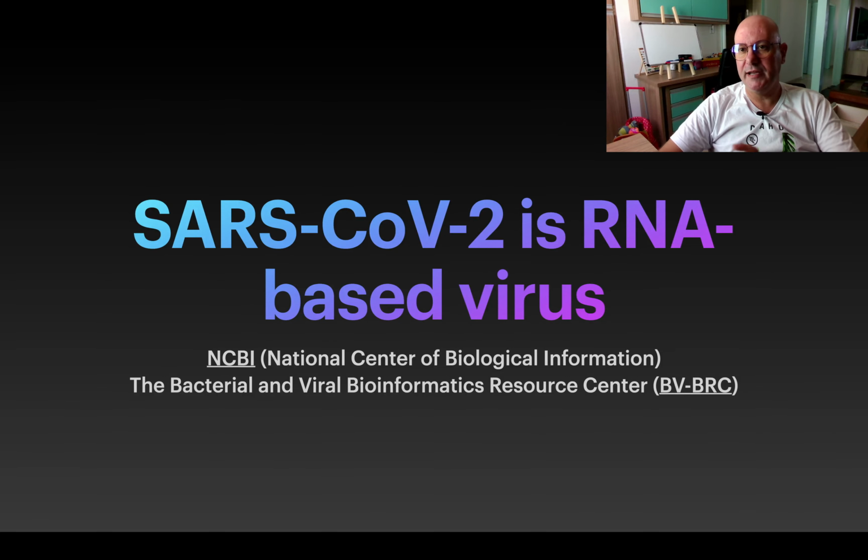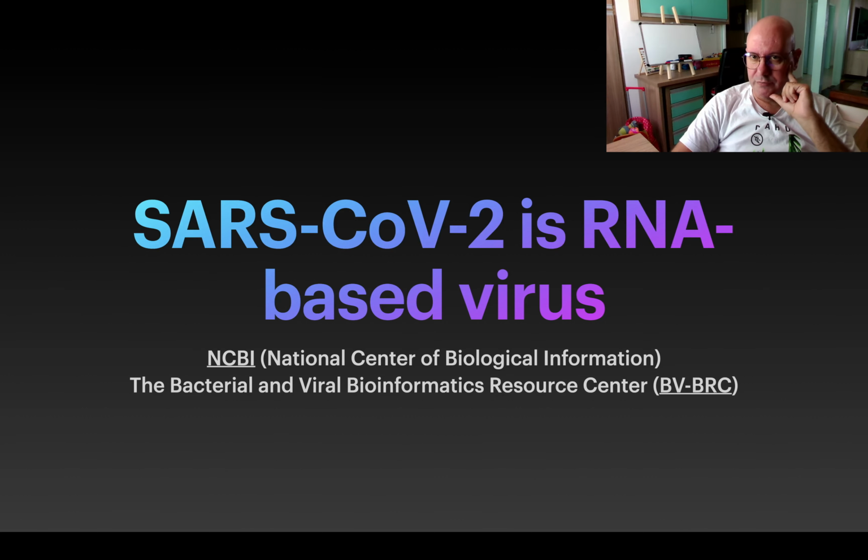I'm here today to tell you how you discover a variant of the SARS-CoV-2 virus, and you can do this easily by using Biopython. Biopython is a set of tools that help us a lot with bioinformatics. Here I will give you some very superficial biological background, just for you to understand what I'm doing during the discovering process.